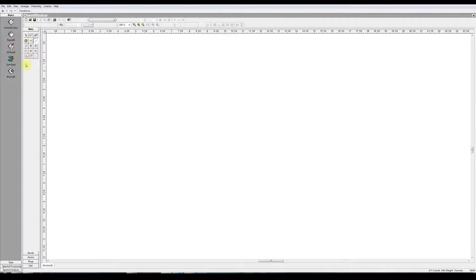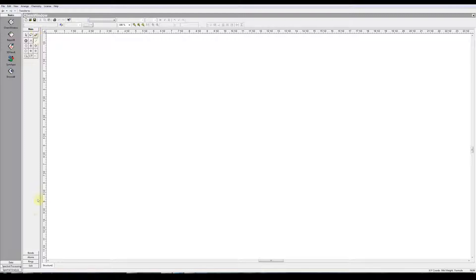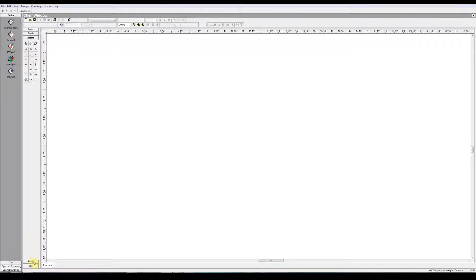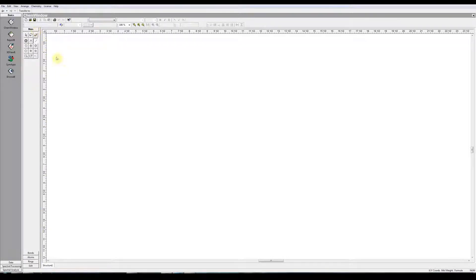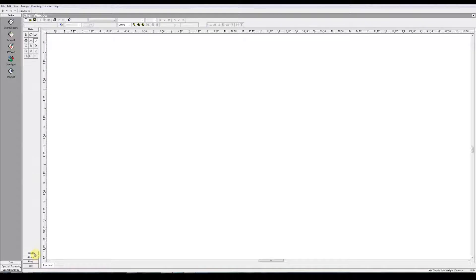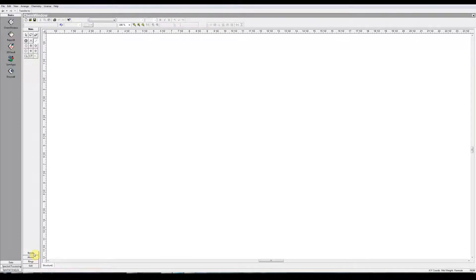In the left pane, there are toolbars. And I notice there are actually five sets of toolbars here: Main, Bonds, Atoms, Rings, and Edit. You can do most of your work using the main toolbar. If you need additional help, you can find them specifically on these other toolbar groups. You can edit or customize any of these as well.